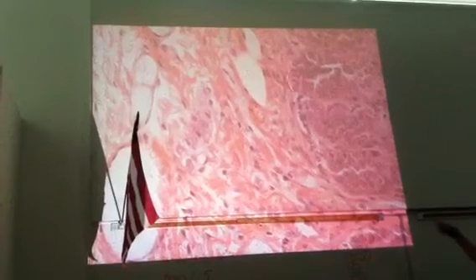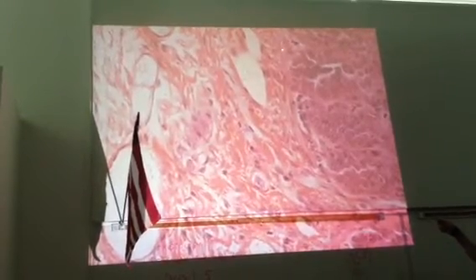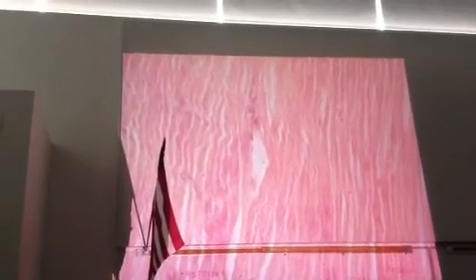The third portion of the tunica mucosa is going to be the muscularis mucosa. And here we see the smooth muscle cells of the muscularis mucosa. That means we're out of the mucosa, now we're in submucosa, which we just did here. And then we'll continue out and we go into the muscularis, inner circular, outer longitudinal. And the profiles we see here are the nuclei of the smooth muscle cells.